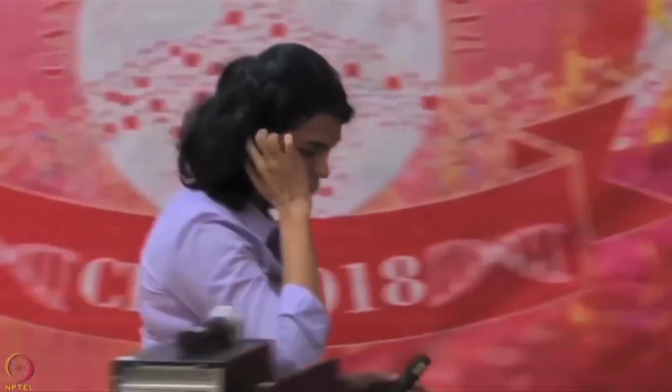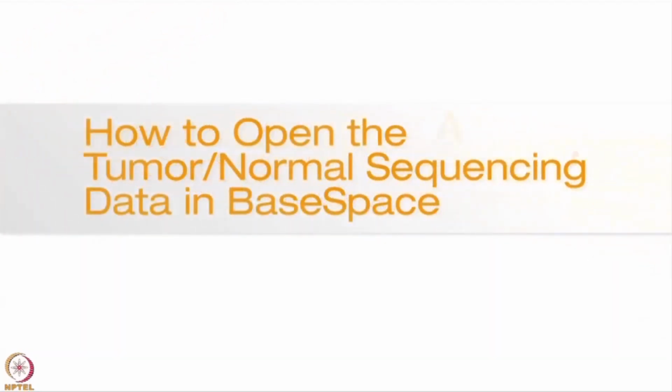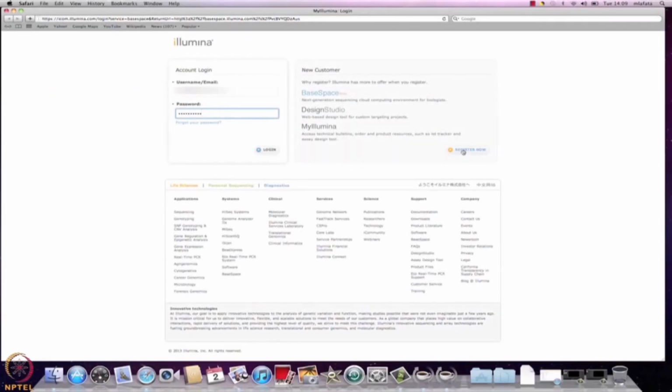So, now we can actually move on to clicking on the link, which will take you to the BaseSpace login page. Log in or create an account by clicking Register Now. This will give you instant access. The first time you log into BaseSpace, you may need to read and accept the user agreement.